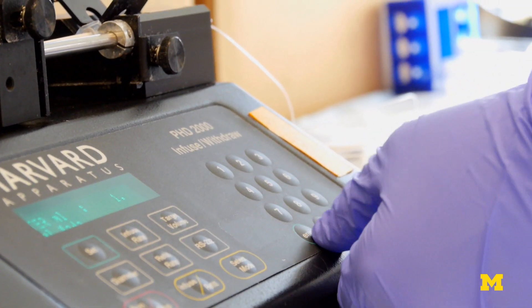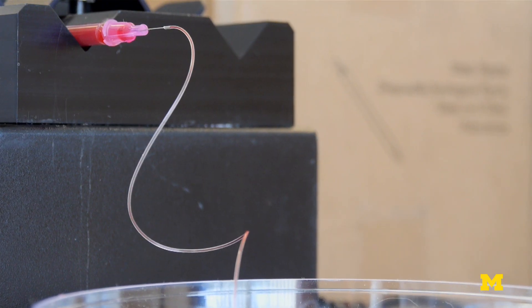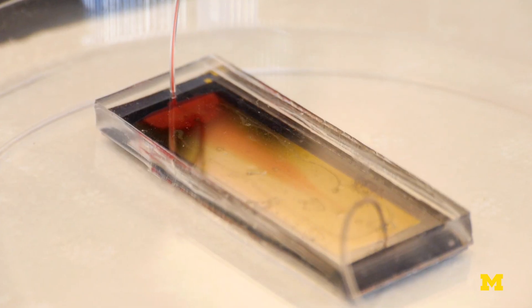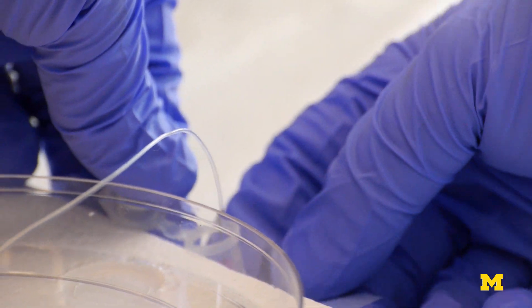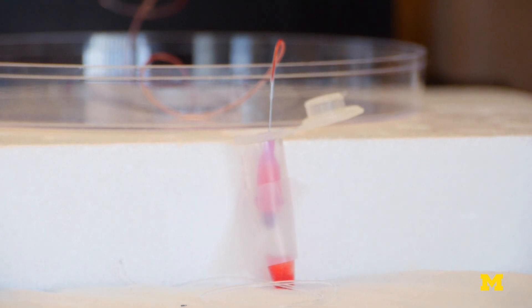The biggest challenge in doing this is that the cancer cells are very rare in the blood — there may be maybe one to five cells per milliliter of the blood. That is like one cell against billions of other cells. Using microfluidic technology, we could manipulate the sample on a substrate very specifically, so we can put the cells where we exactly want, so that we can capture the cells of our interest with high sensitivity, and the rest of the blood cells go away.